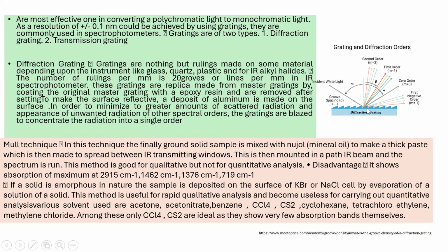What is it going to generate? When I say zero order, you see there is no colored arrows shown, right? You see the intensity of the colored arrows which are getting generated. Colored arrows indicate the light generated from the light source is broken down into its component colors. So different colors are shown, different wavelengths, wave bands. But when you say zero order, you see only one dark gray line, right? Generally, first order is the region where we select for any analysis.